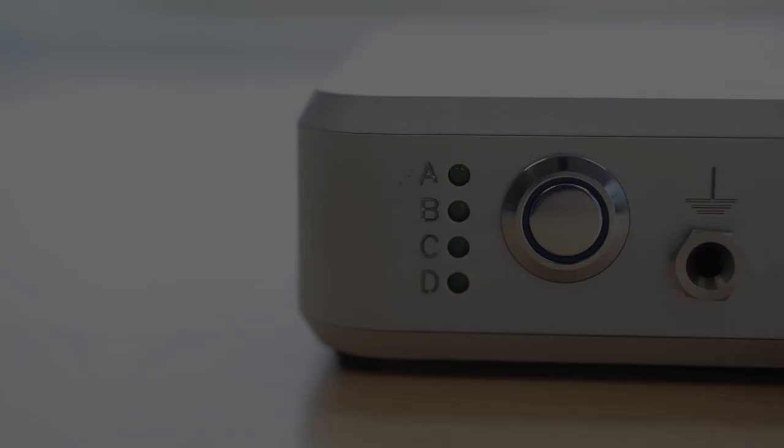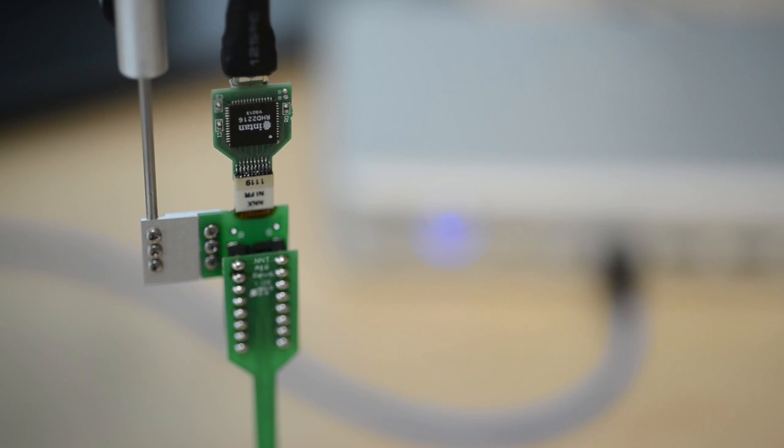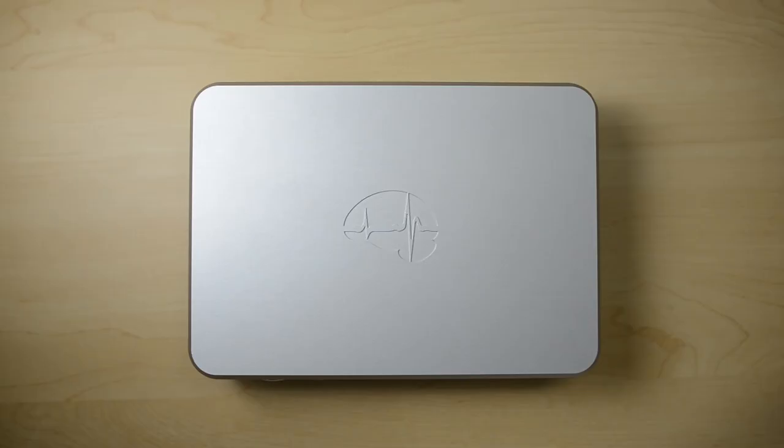With the convenience and essential features of a rack-mounted system, the added freedom of portability, and an affordable price, the SmartBox is an unprecedented tool in the field of neuroscience. Visit Neuronexus.com for more information.